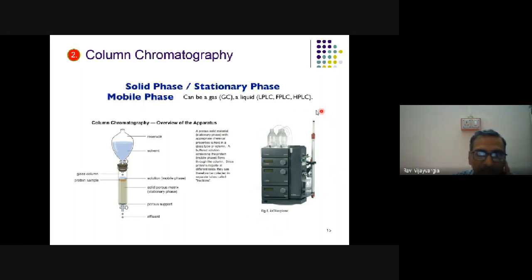Okay, so this way, the machine helps a lot, but again, this is an expensive proposition. So if you have money, you can use a machine. If you don't have a lot of money, you can use the manual system.